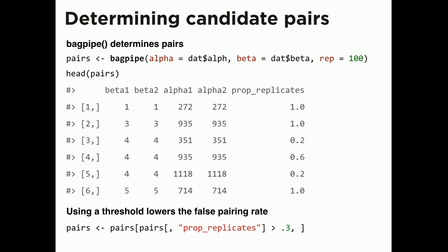But wouldn't that also influence your frequency estimations, getting rid of the noise? Yeah, so in the function, it does require the person doing the sequencing to have an idea of what that error rate is. I don't remember if we put this in the paper or not, but we have another experiment that you can do to estimate what that error rate would be, and then that would be an input into the function, which would try to accommodate for that.